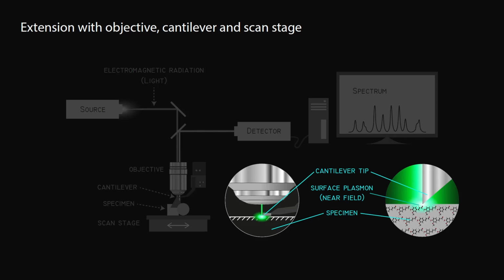Because the IR and Raman signal intensity also depends on the field strength, so that higher field strength means higher signal, the molecules in close proximity to the tip experience the highest field strength and therefore produce most of the scattering relative to neighboring molecular regions. Because scattered radiation undergoes the same enhancement process, both incoming and outgoing radiation are intensified. As this signal enhancement depends on the distance from the tip to individual molecules, those molecules closest to the tip will make up for most of the total signal reaching the detector, and that is how super resolution is achieved.